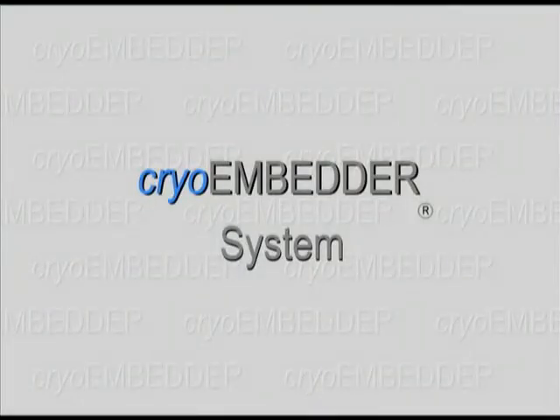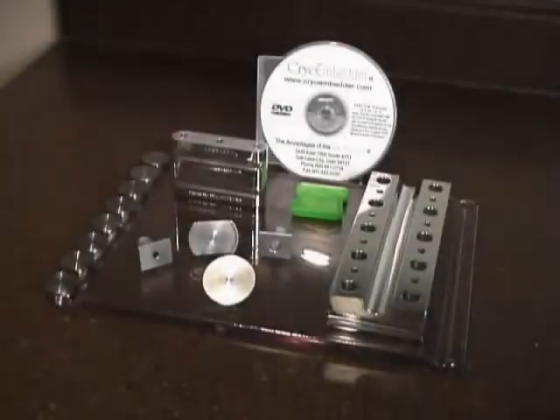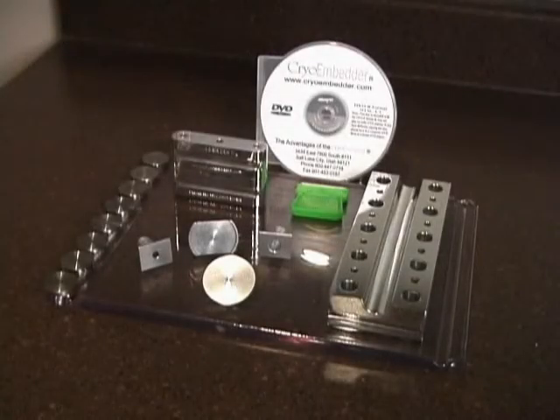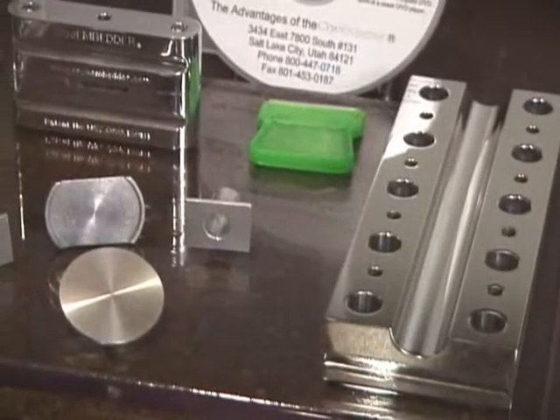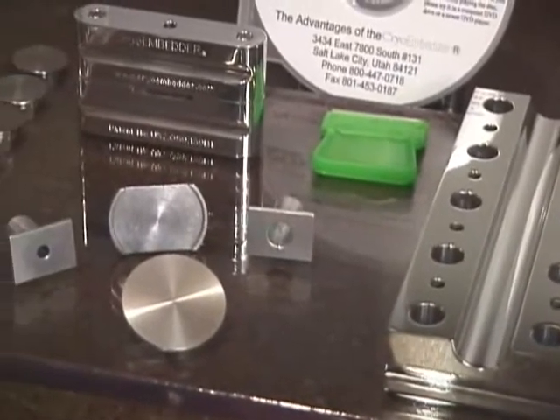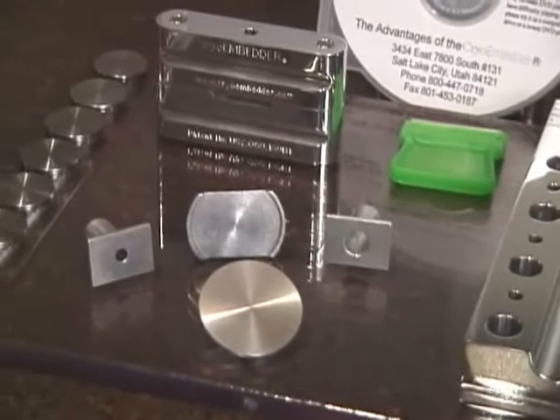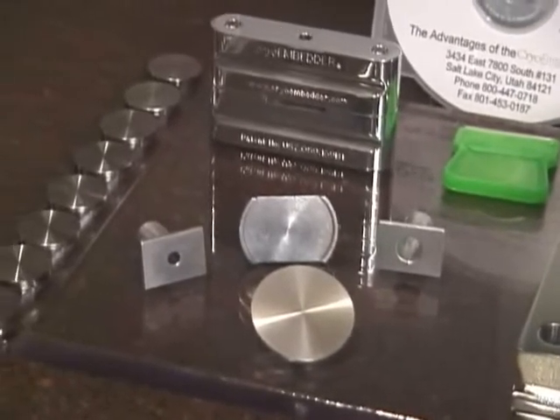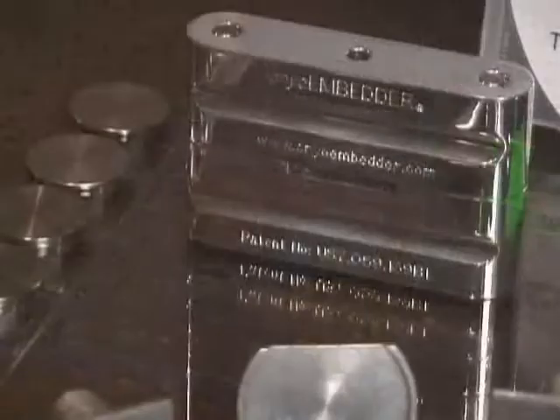The Cryo-Embedder system, a tested and proven method for preparing tissue for frozen sectioning. It consists of a cutting board, chuck holder, cryostat adapters, a trimming blade, flat embedding discs, instructional CD, and the embedding device.